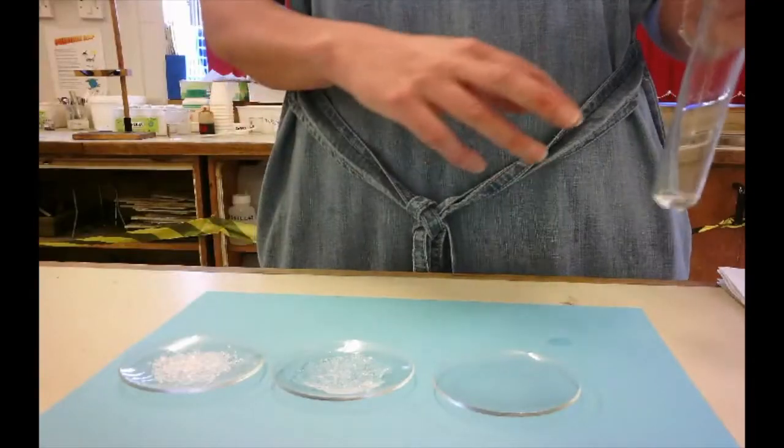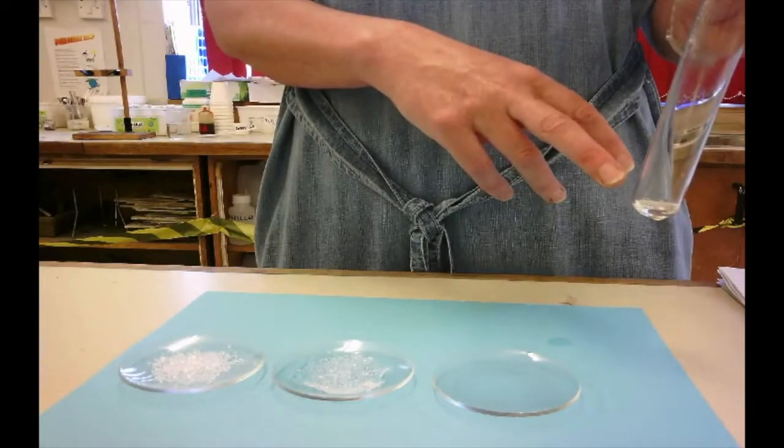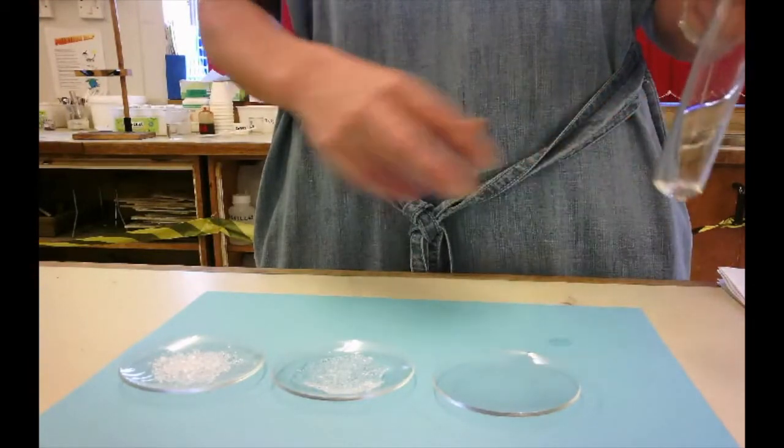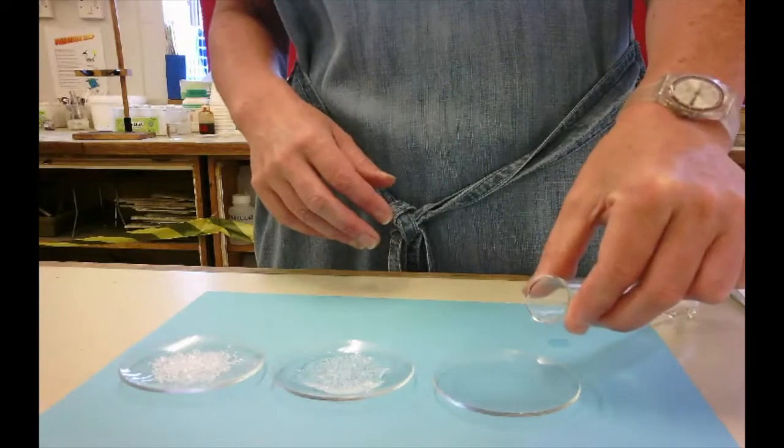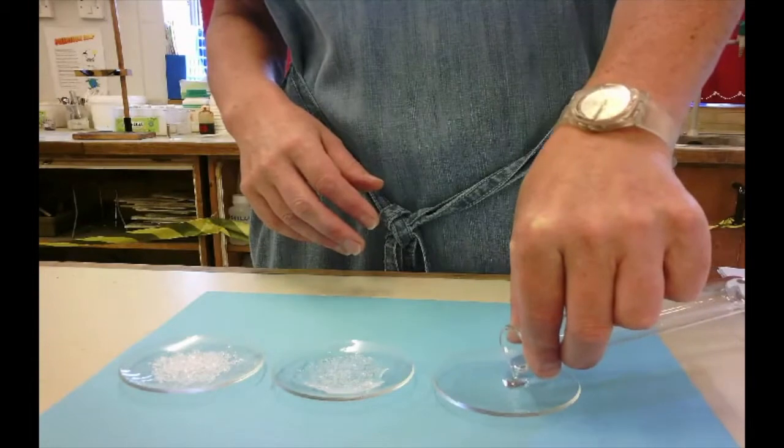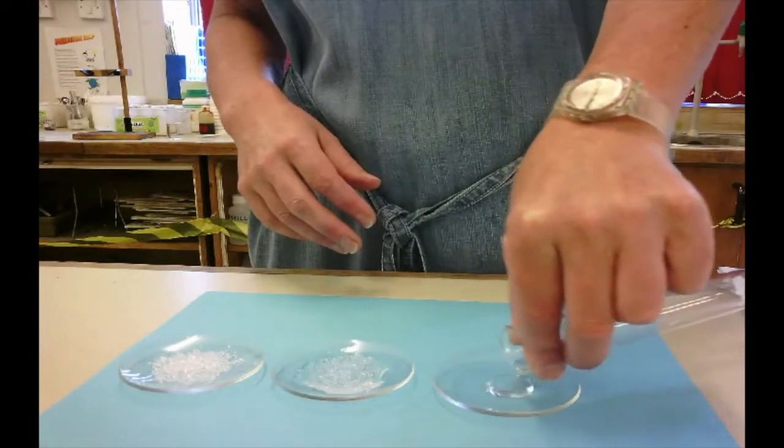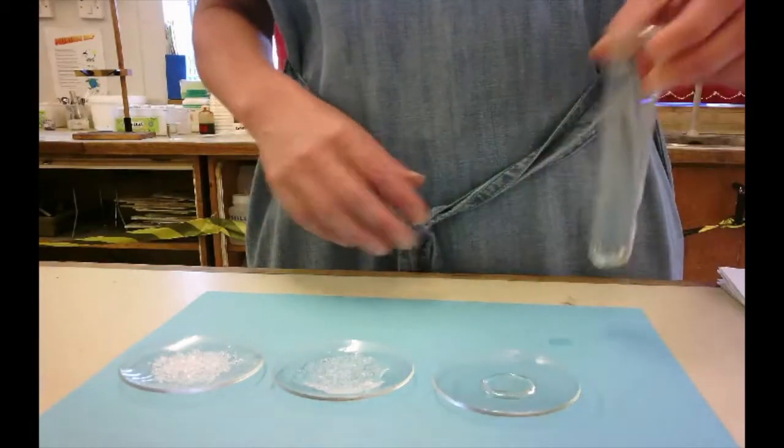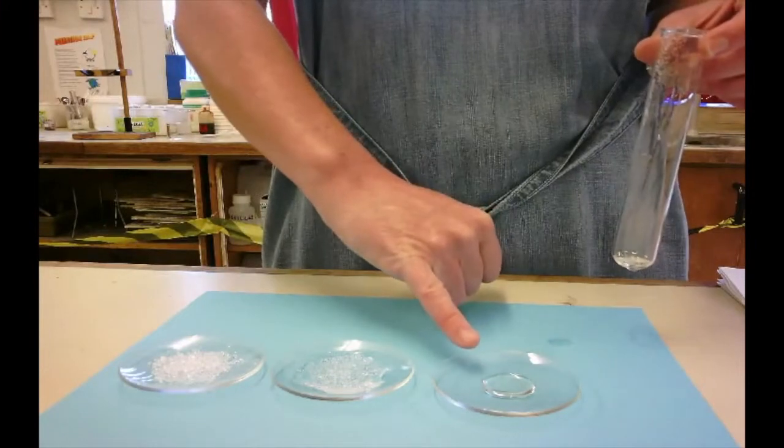So I've taken the melted salol out of the hot water. It's now a colorless liquid, and I'm going to pour a small amount onto the watch glass. What will happen is, because this watch glass is cold, the salol will start to solidify.